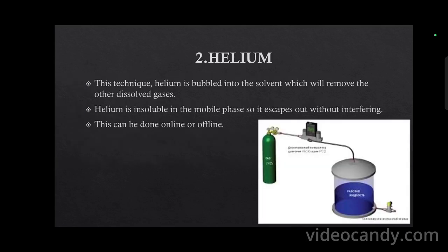Next is helium. In this technique, helium is bubbled into the solvent, which will remove the other dissolved gases. Helium is insoluble in the mobile phase, so it escapes out without interfering. This can be done online or offline.